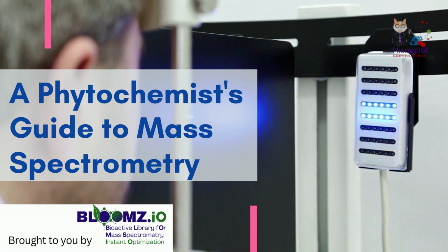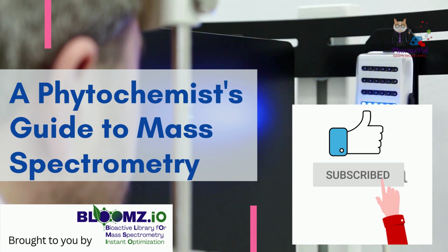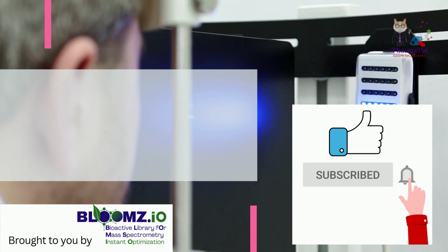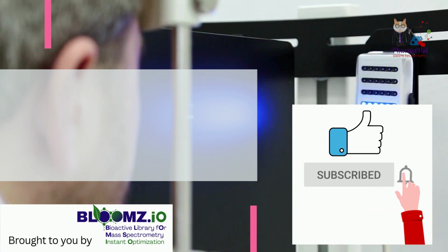And linking this back to the bioactive part, how does the mass spec data help find the compound that's actually doing something biologically? That's often done by combining mass spec with bioassays. You might fractionate the original extract, test the fractions for activity. Find the most potent fraction. Exactly. Then you analyze the active versus inactive fractions using mass spec. You look for compounds that are present, or present in much higher amounts, only in the active fractions. So you correlate the chemical profile with the biological activity. Precisely. Mass spectrometry lets you see what chemical differences correlate with the biological effect you're interested in. It connects the chemistry to the function.